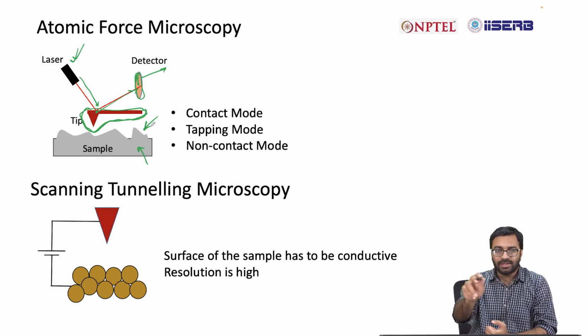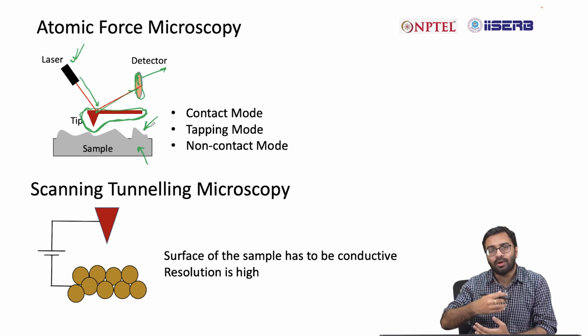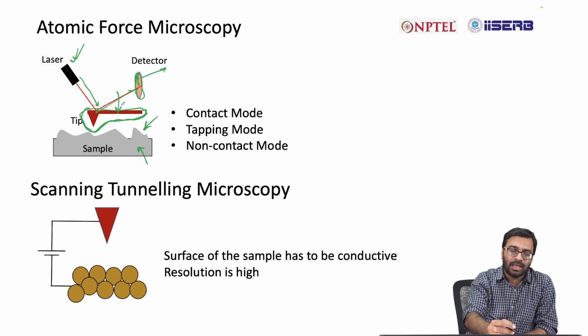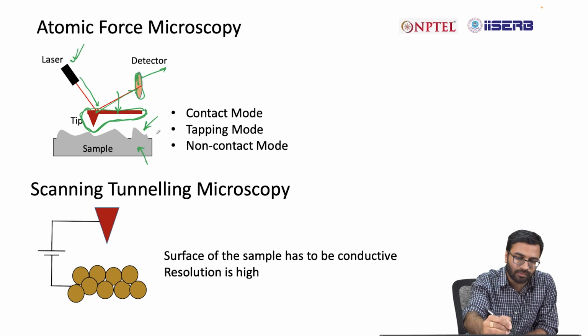Sometimes he scans different locations in order to understand whether the road is smooth or if there is an obstacle or a stair in front, and based on the feedback he gets from the stick, he visualizes the condition of the road, right? Similar to that, here this acts as the stick, and based on the deflection of that stick, the system detects the morphology of the structure.